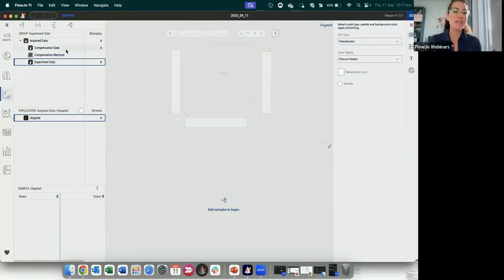So we have all the samples on the left side, our work in the center, and then on the right, let's say we have all our reagents. So basically we have all the characteristics, all the settings for what we are doing. And you will also notice that we don't have a horizontal bar on top anymore, but all the activities can be accessed by the left side of the panel right here, the navigation bar.